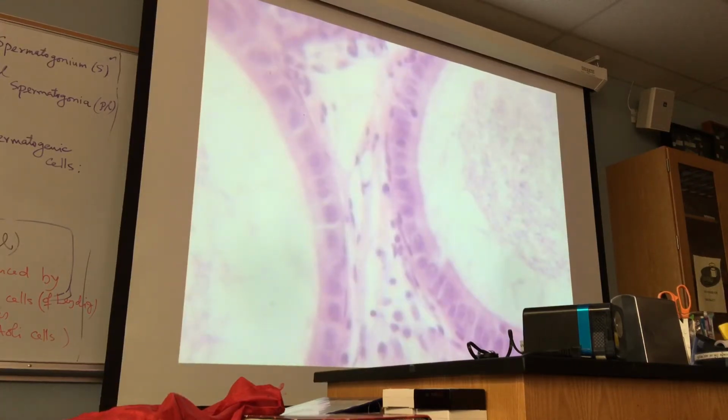But when the epididymis was first described, these structures were thought to be cilia. Yeah? But they are not cilia, they are microvilli. That's why they gave the name stereocilia. And nobody bothered to change the name. Yeah, we still learn it as stereocilia, but these are microvilli.